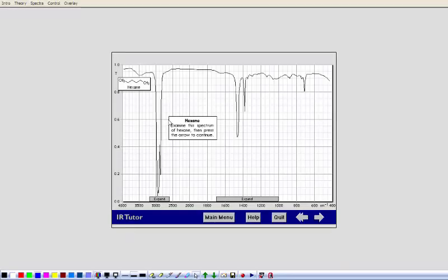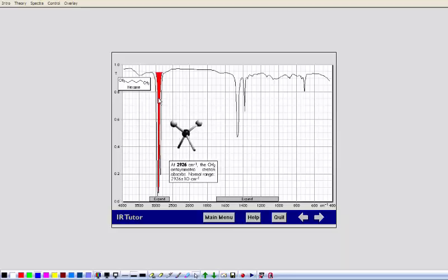You can see that for hexane and basically for any of the alkanes, it's a pretty boring spectrum. There's only a few intense peaks. And remember, the peaks are upside down in our spectrum. But these types of frequencies turn out to be different types of stretching and bending motions. So one of them is an asymmetric stretch of a CH2.